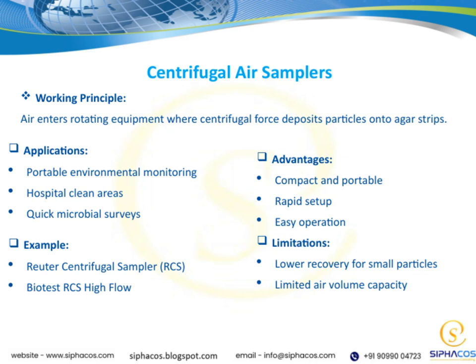Now let's talk about some advantages. These devices are compact and portable, making them easy to carry around and set up wherever needed. They also allow for rapid setup, which is crucial in time-sensitive situations. Plus, they are generally easy to operate, even for personnel who might not specialize in microbiology.